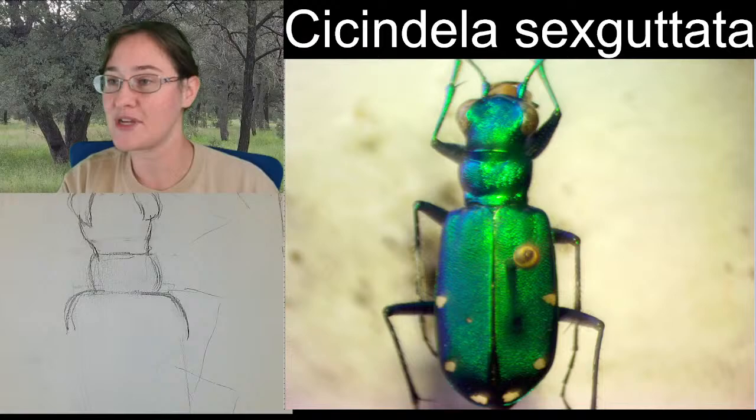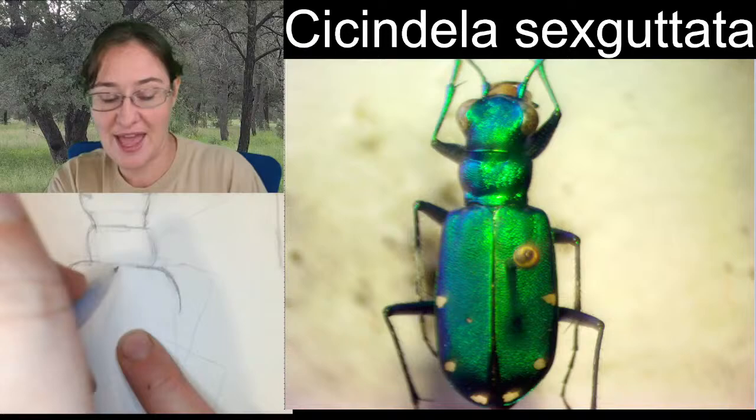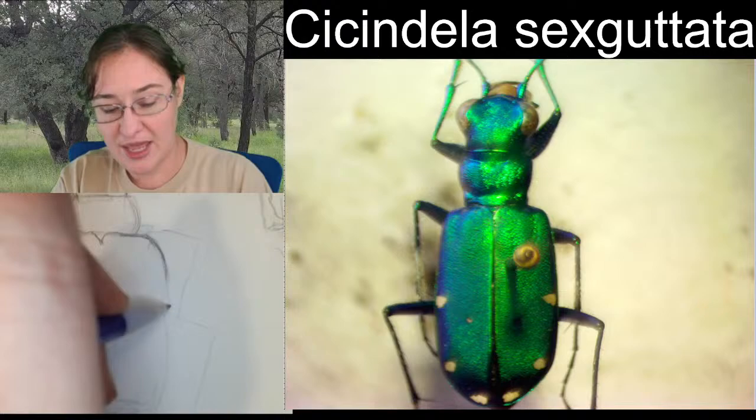All right, so we have our head kind of lightly sketched out. This is our pronotum, this kind of thin neck-like area. This is where our first pair of legs are connected. And then once you move past that, you're going to have the little triangle here. That's your scutellum. And then you have shoulders, and you have the elytra, or the wings. Don't need that anymore.